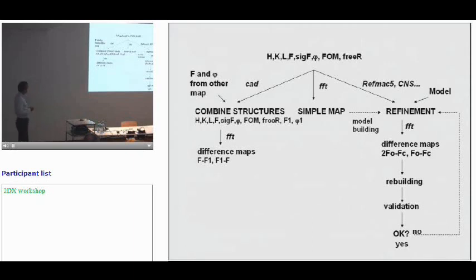Often it's useful to calculate the differences in both directions, because some visualization programs, at least I've seen some versions of Chimera, don't handle negative density, so it might be a good idea to calculate the differences in both directions. This is very simple.